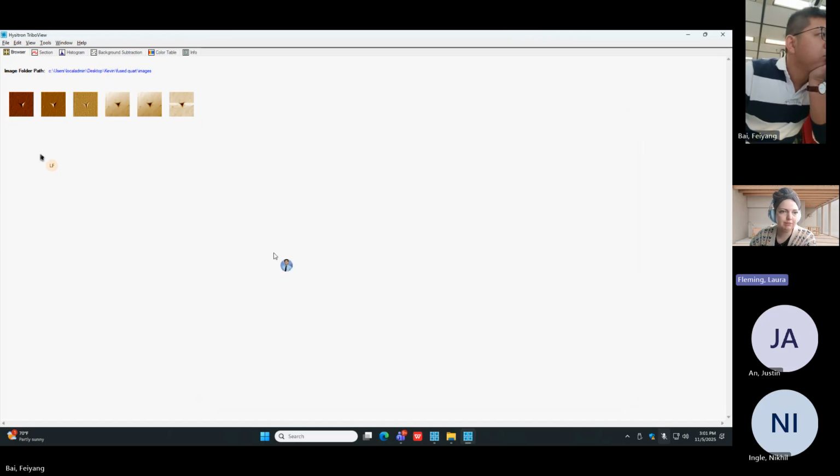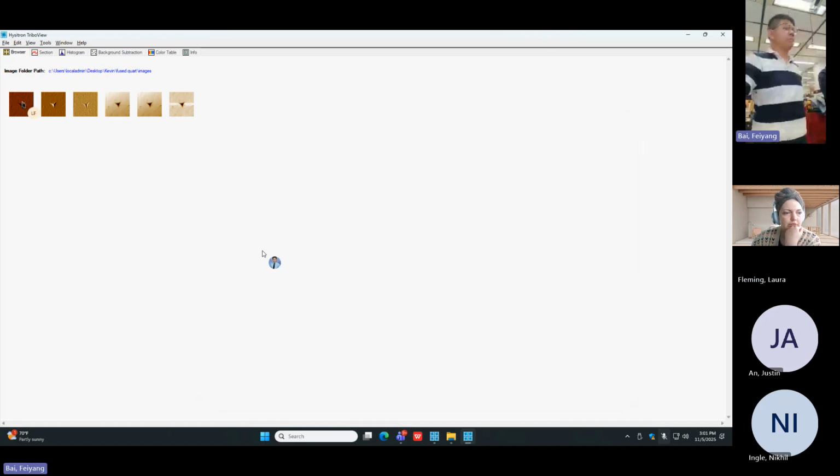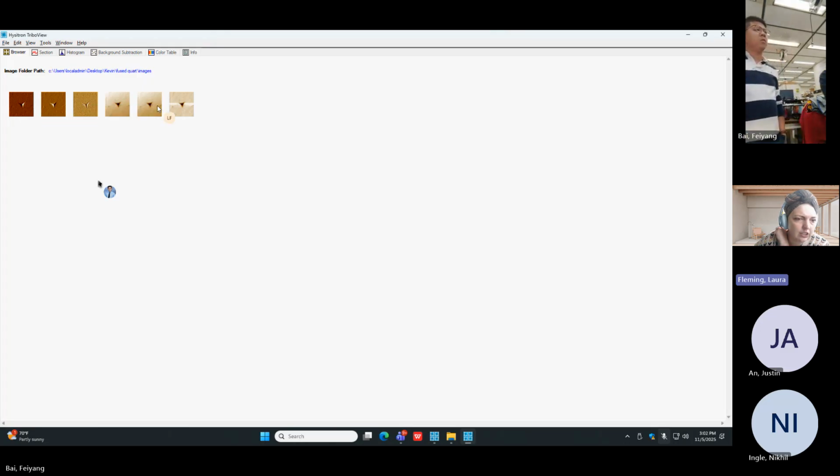And they will populate. So the first 3, if we hover over them, you might have to do it. Will it let me? Okay, so do you see how this says GF at the end? You have your base file name and then GF. And then this is GR, GV. This one's TF, TR, and TV. So you get 3 gradient images and 3 topographical images. The topographical image was what we were looking at in the TriboScan software. We just happen to have that one selected. You can look at the other ones.